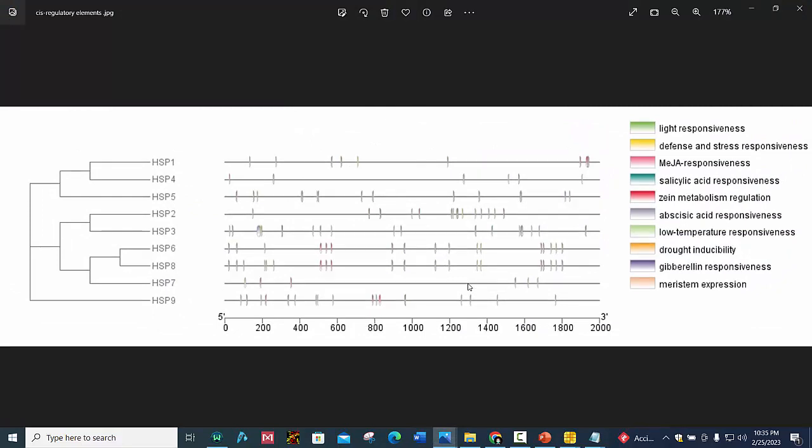In this manner you can locate the position of cis-regulatory elements in promoter region. I will also make a separate video on how to construct Newick tree using MEGA software. Later you can use this picture in your manuscript.